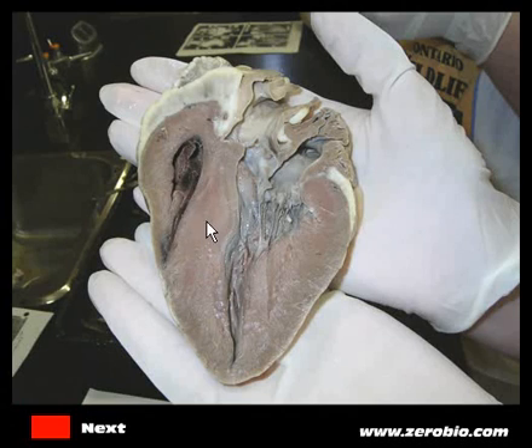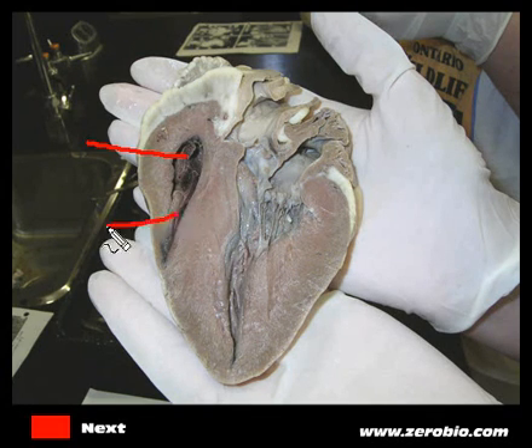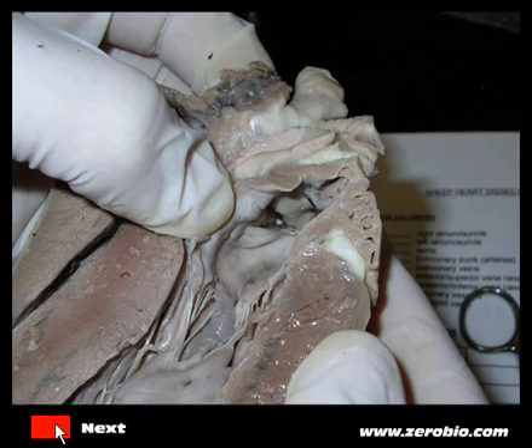In the middle right here is a region that separates the right side of the heart from the left — this is called the septum, a very thick wall. On the other side we can see a little bit of what looks to be the right atrium and the right ventricle.